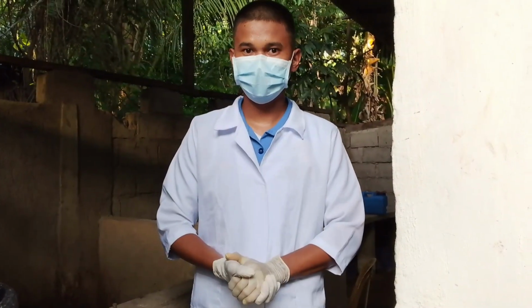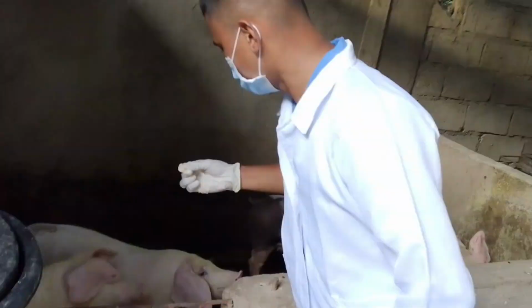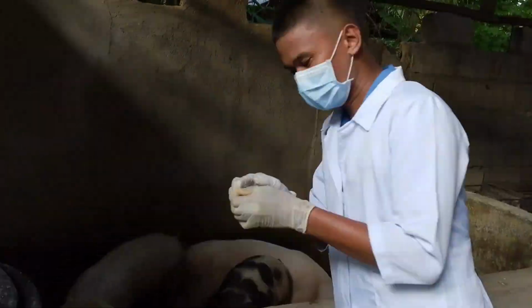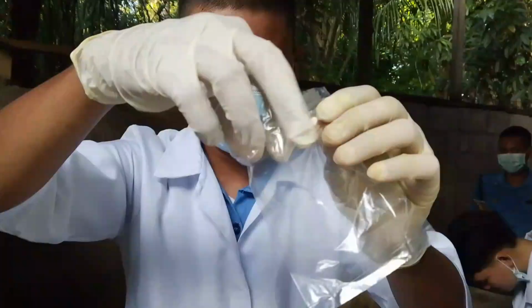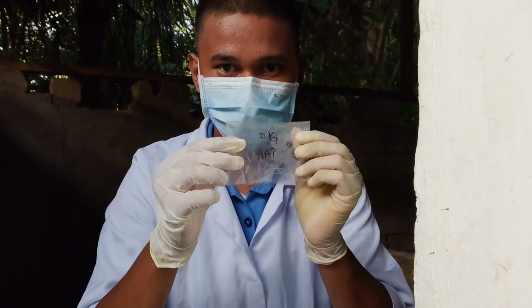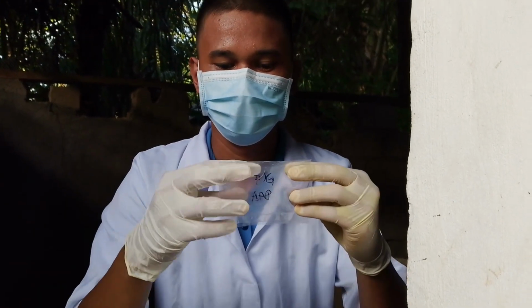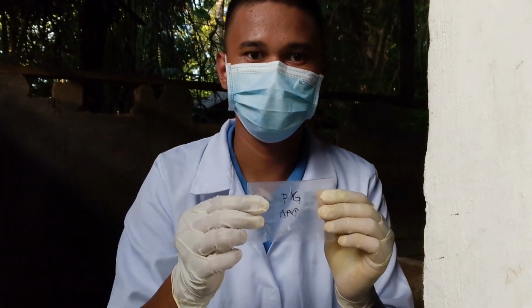I will now proceed to the last animal, which is the pig. I am now done collecting the pig hair. This is the last animal that I will collect hair from. I am now done collecting the animal hair.